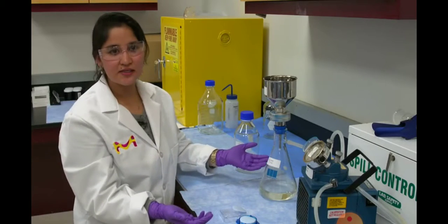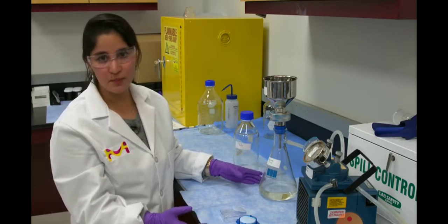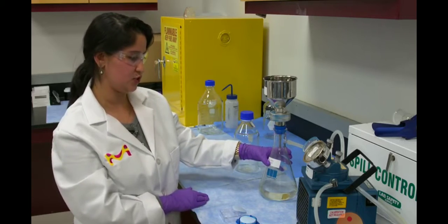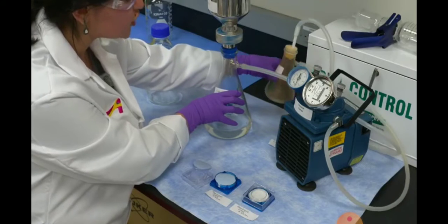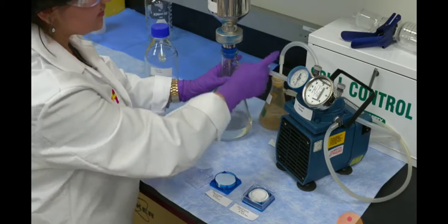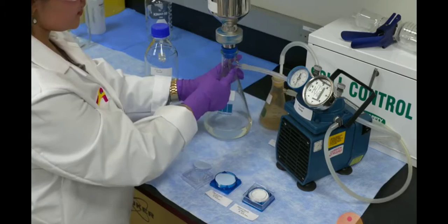What is not shown here is a sonicator water bath, which is recommended when you use a buffer. The sonicator bath will degas your mobile phase of anything that can cause contamination. The other main component here is your trap. The trap takes in any bubbles, any contaminations that can flow back into the funnel through the tubing.